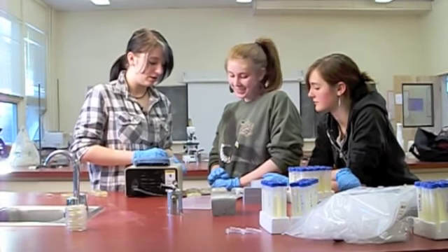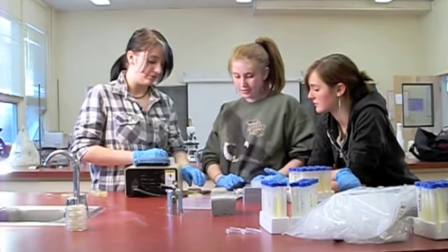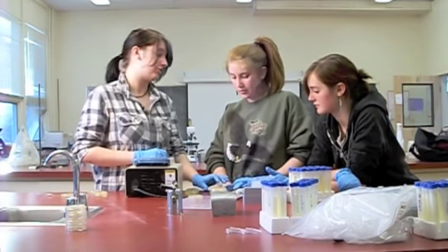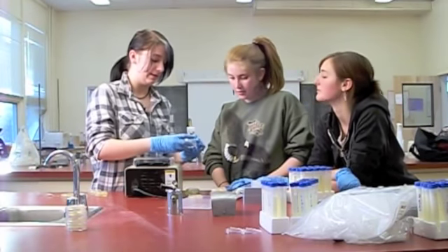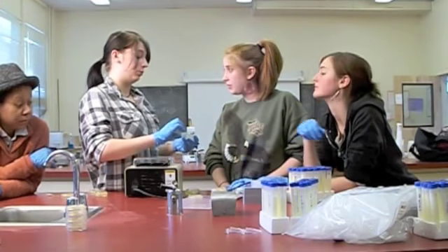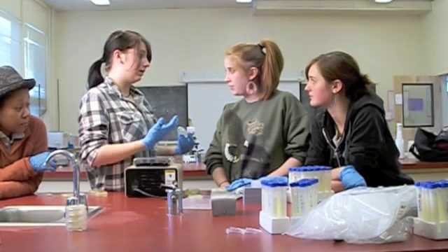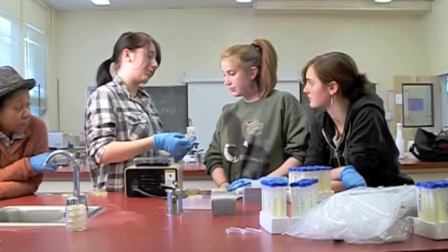So we do these two that don't have the ampicillin so that we can see if the cells are actually alive. Because what we have here is E. coli that we put with DNA, so it has the plasmid in it, and we wanted to see whether it would pick up the plasmid or not and whether it would grow at all.